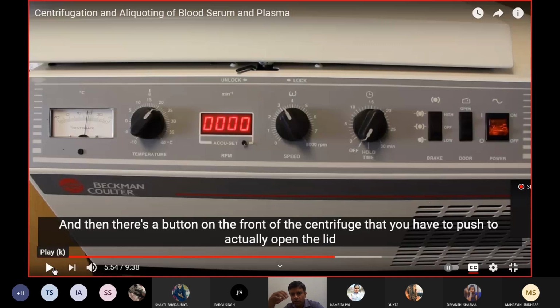Because if you open while it is still revolving inside, it will sometimes stop with a hard brake. In that case, the whole purpose of separating may get defeated. So you need to have that patience. You should allow it to stop, right? Give it that full time. And again, it is also important to prevent any damage to the centrifuge itself, because these are expensive centrifuges.